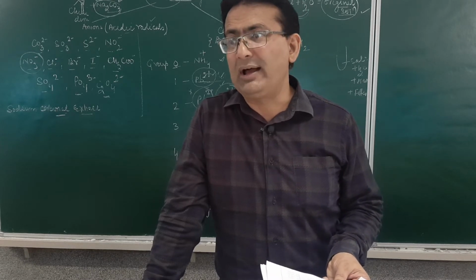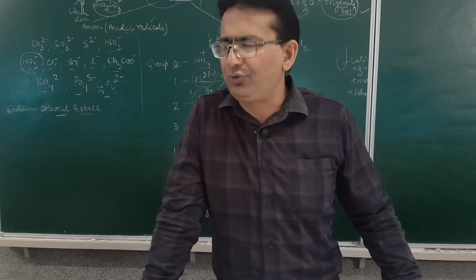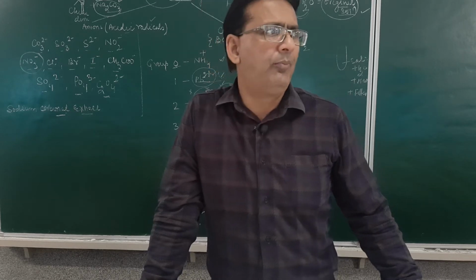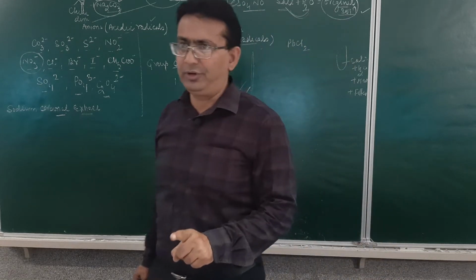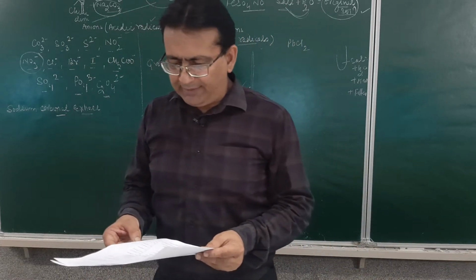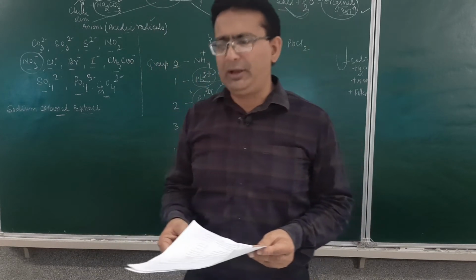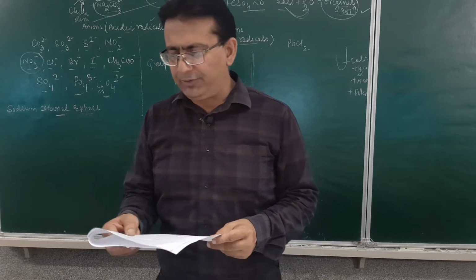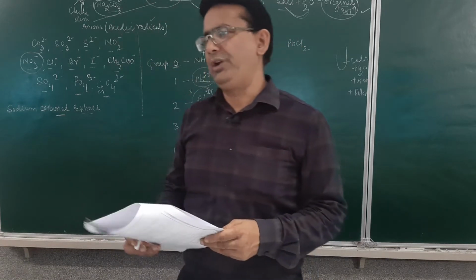You know from class 9, to the sodium carbonate extract we add dilute acid, either H2SO4 or HCl. A sulfur dioxide gas will be given out, which is a suffocating odor gas. Pass the gas through KMnO4 solution. It will decolorize the pink or the purple color of the KMnO4 solution. Remember those tests? All the tests are written over here, students. Carbonate, sulphite, sulphide. In this case, H2S gas will be given out, which again will be a rotten egg smelling gas. Then nitrite, you may look at the next page. Then the test of nitrate, chloride, bromide, iodide, acetate, oxalate, sulfate and the phosphate anion.